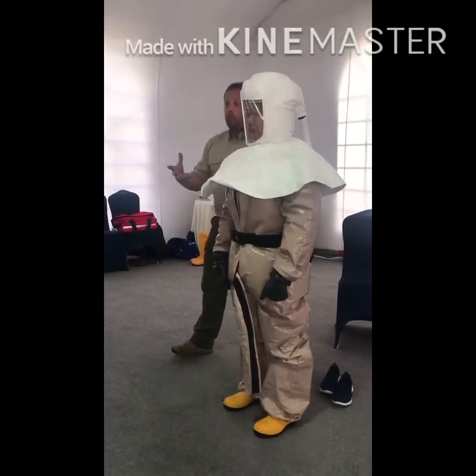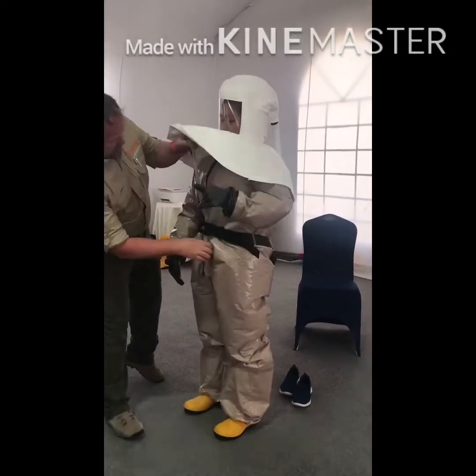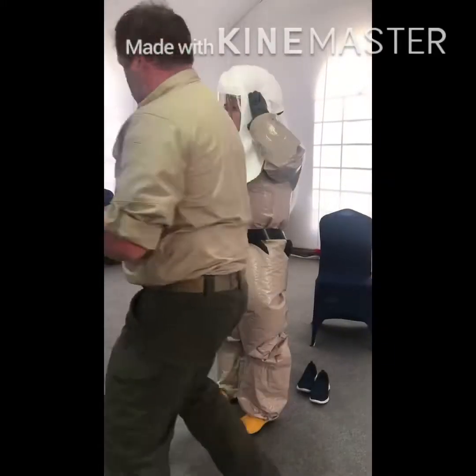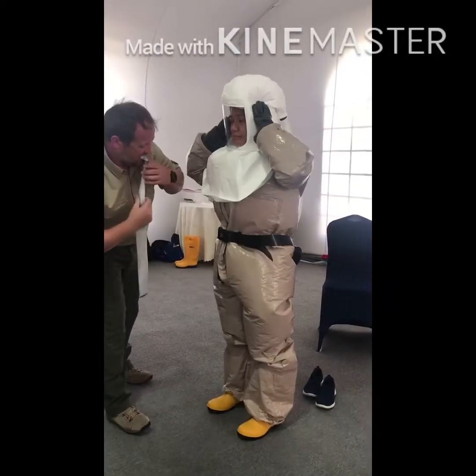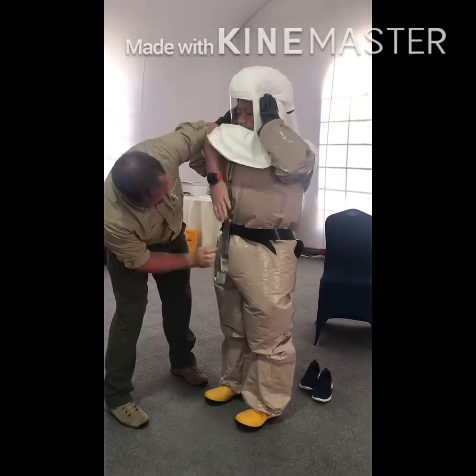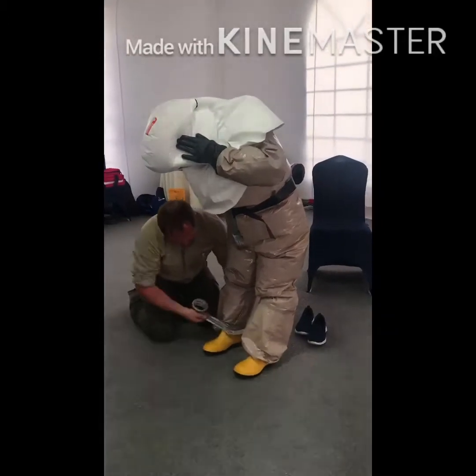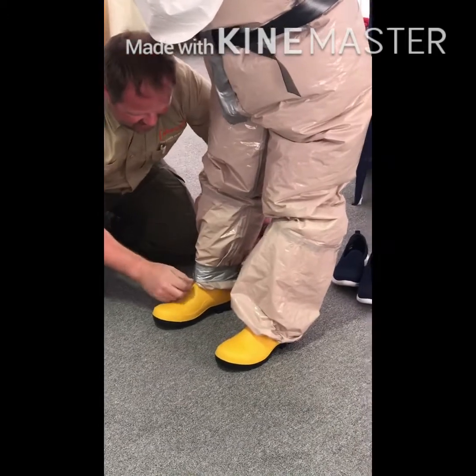There's a couple more things I need to do before I let her leave. I always tape any flaps. So tape any flaps shut, like so. Because we're worried about feet, I tape around the bottom to stop anything accidentally leaking inside.